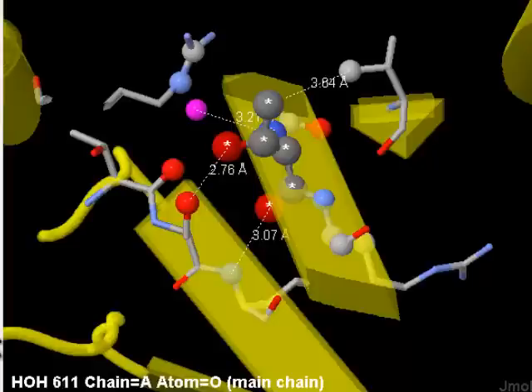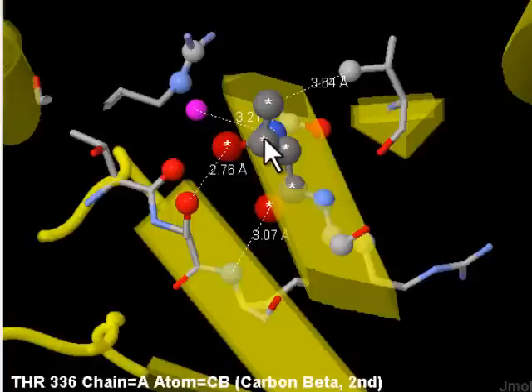Okay, so your goal is to pick a different amino acid in the same protein and explore the side chain interactions a bit and see in which secondary structure it is placed, and then take a snapshot and paste that onto Piazza so we can see which residue you looked at. The last thing maybe to do is click on here so we see which residue it is, and then I can take my screenshot. Okay, that's it.